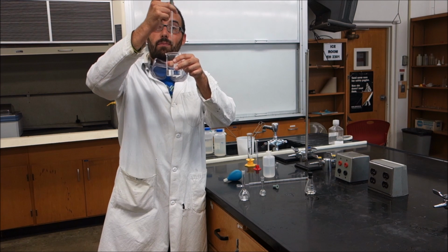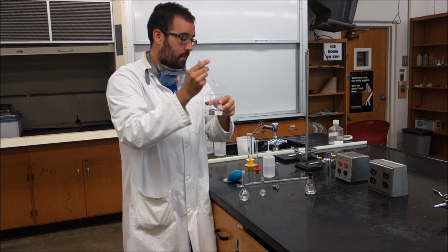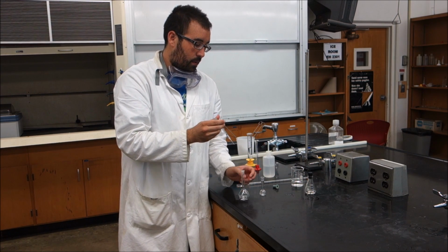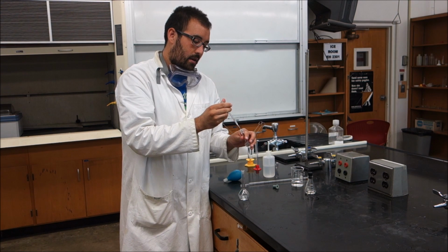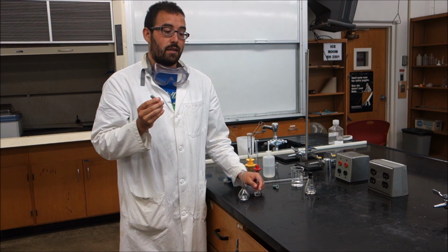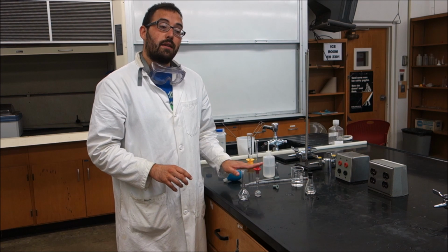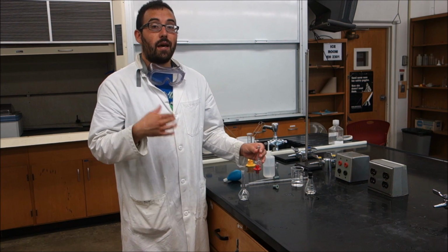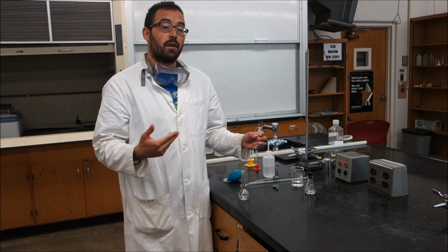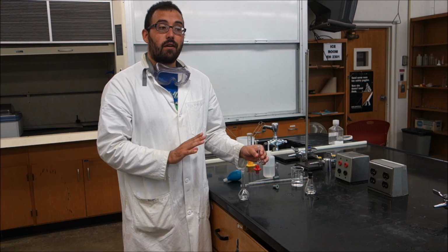And you'll notice, without putting any pressure, the liquid is still staying inside of the Pasteur pipette. Now, if we wanted to fill this guy up again, we could simply put it in there and give it a squeeze, and it will eject all the liquid that was in this Pasteur pipette. So those are the two safe ways to top off your volumetric flask without going over. Now, if you do go over, unfortunately, you have to start again because your concentrations will not be the ones that you calculated. So be very careful when you're doing this.